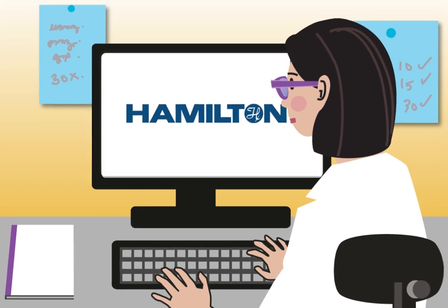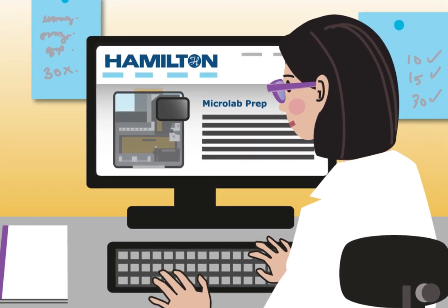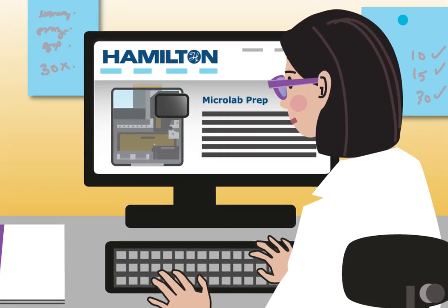But Michelle is in luck, because Hamilton has designed the Microlab Prep for labs just like hers.